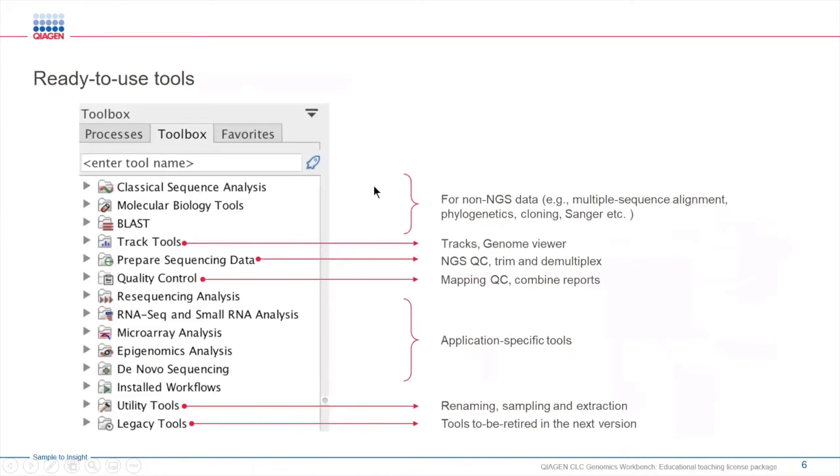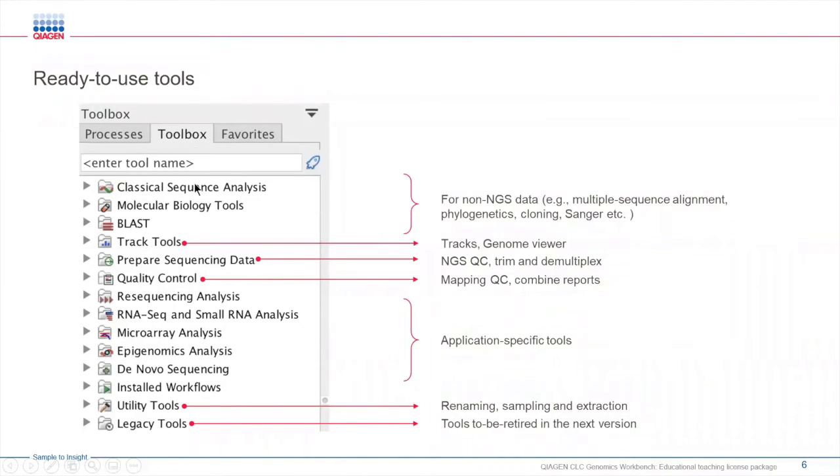The Genomic Workbench has several different tools for various types of analyses. These tools are organized under the toolbox in different folders. Within these folders you will also find subfolders, making it easy to find the tools needed for a specific step in the analysis pipeline.